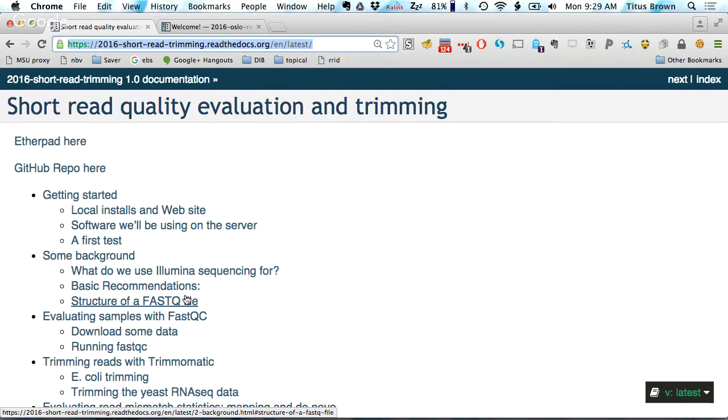Okay. So contrary to the installation instructions, there is one twist. I'm trying something slightly different. Rather than having everybody run their own Amazon Web Services server for this, we're actually going to be doing everything on a hosted website called MyBinder. You don't have to worry about the details, but what it lets us do is run these commands without having to install anything. And I'll talk through all of this as we go. So you won't actually need anything other than a web browser today.